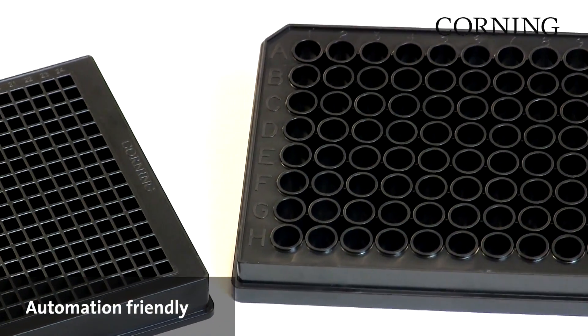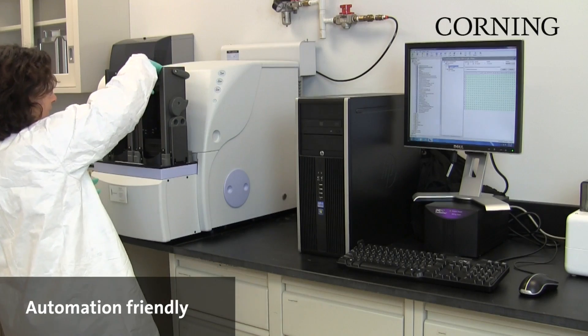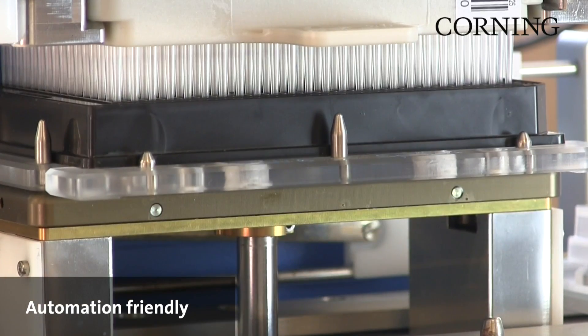Available in 96-well or 384-well format, our plates are compatible with existing imagers, readers, liquid handling and automation workstations.